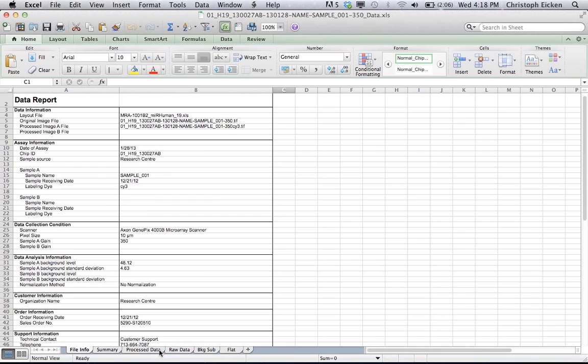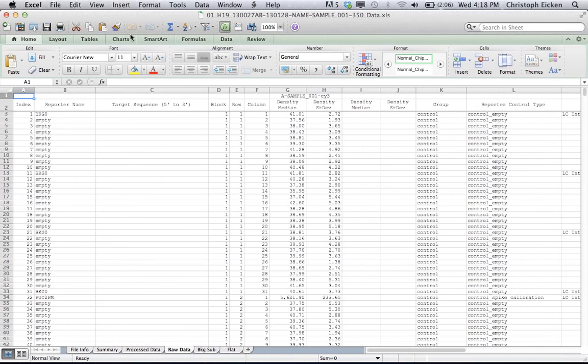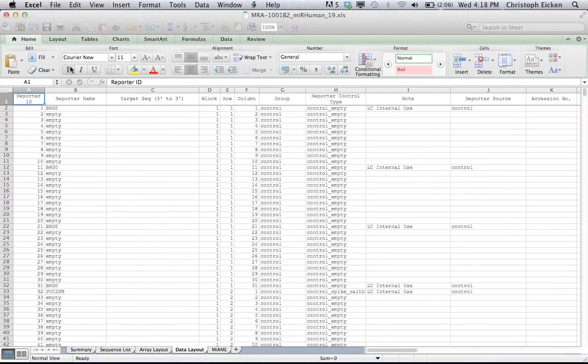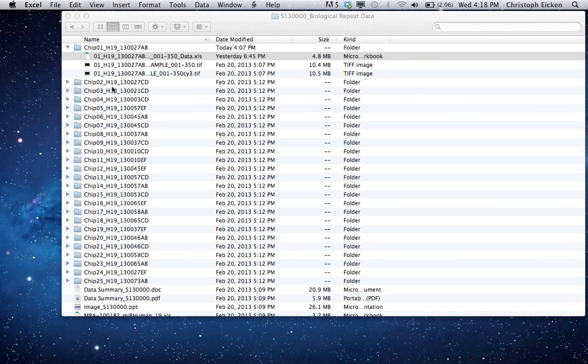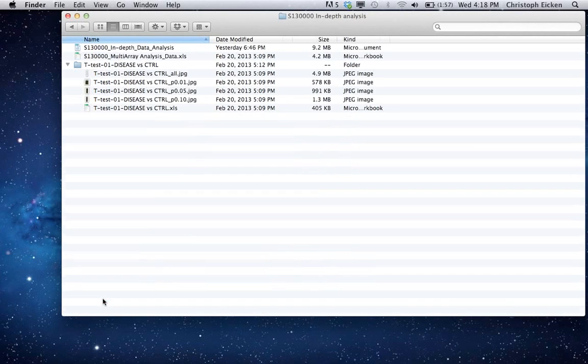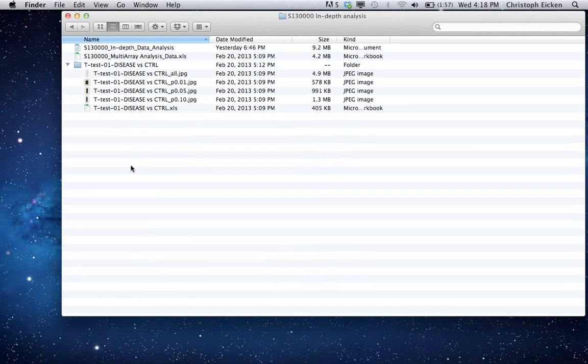So typically you don't have to worry about any of these. For GEO submissions, you will need the raw data page. So if you want to publish your data and you need to submit the raw data to a public database like GEO or ArrayExpress, then you would just go ahead and export this page as a text file. So like I said, typically you don't even have to look into these. The really important or interesting part for you probably is the analysis part. So let's look into this folder.